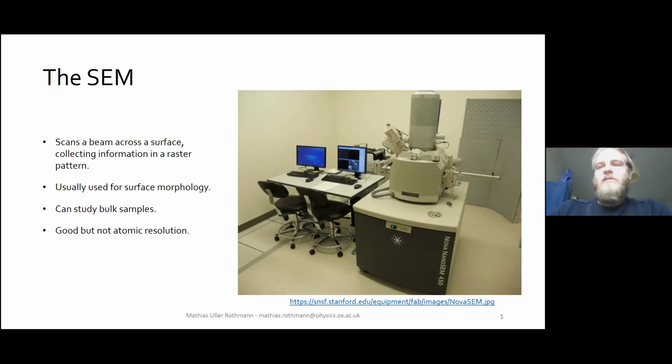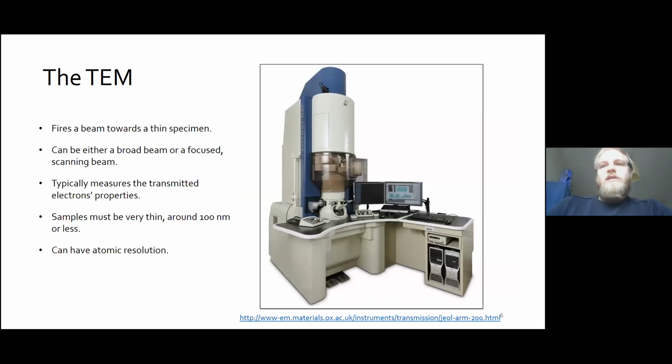One of the cool things about this is you can look at bulk samples. Basically, anything you can fit in the vacuum chamber, you can look at. And you can get pretty good resolution, much better than your visible light microscopes, but not quite atomic resolution at this stage. And so here's a TEM.